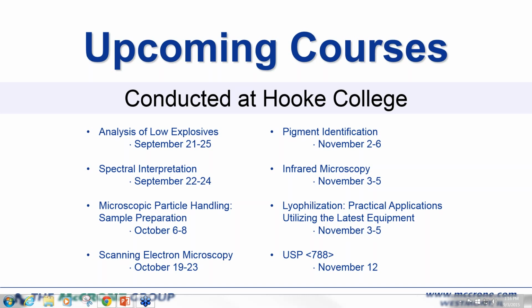This one's from Tom. Does the McCrone Atlas have this information in it that Ken requested? I believe there's some IR information on some of the characterizations, but go ahead, Kate. The McCrone Atlas does include some IR spectra and some interpretation of those spectra, so the spectra are available for viewing within the Atlas. I don't believe that they can be downloaded from the Atlas, but I'm not sure of that.